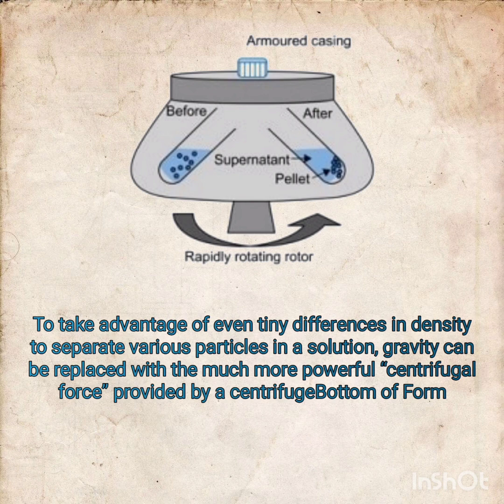And clean for use. So centrifugation is basically a technique which is used to remove all the unwanted particles, all the unwanted substances from a solution or from a liquid. A solution may be of many types. There is no specific solution. A solution may be of some sugar, of some juices, of any material, any type of solution.